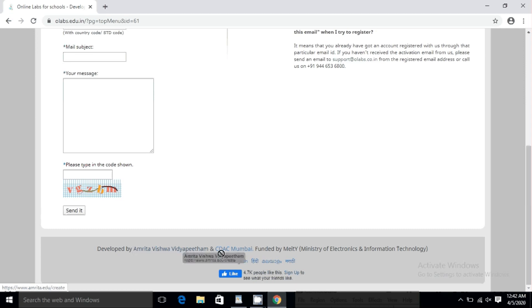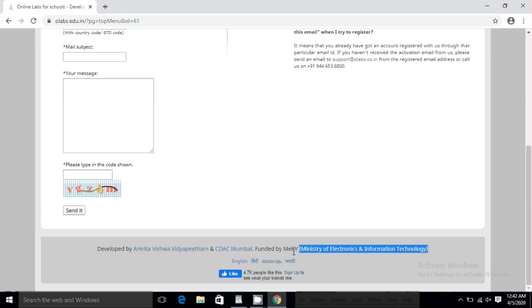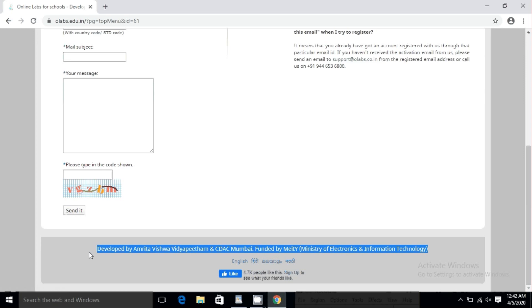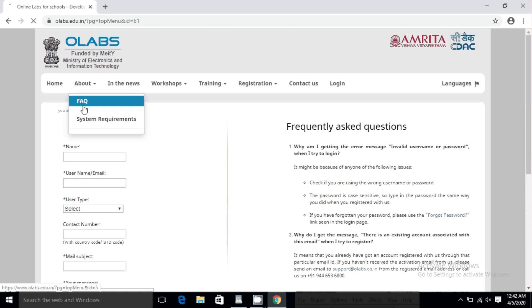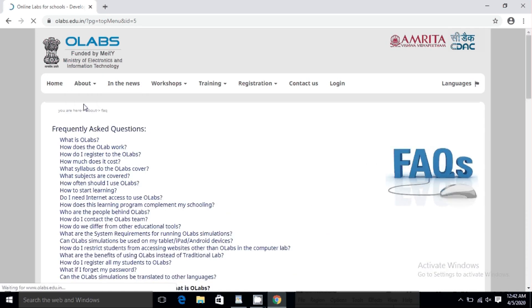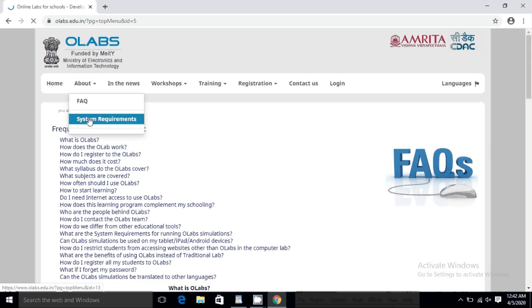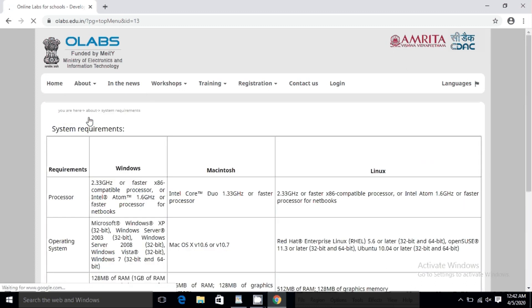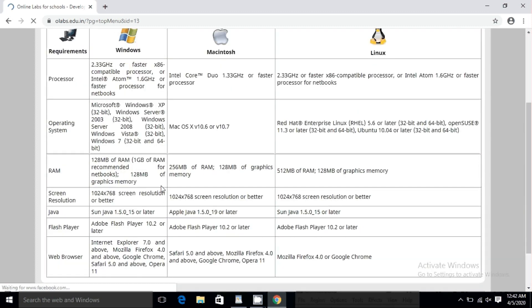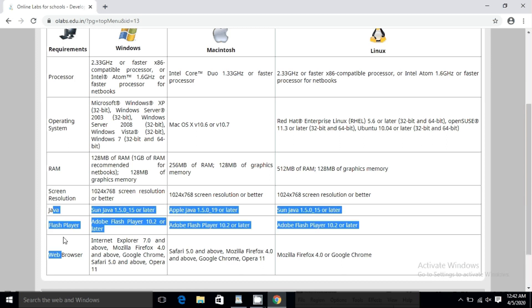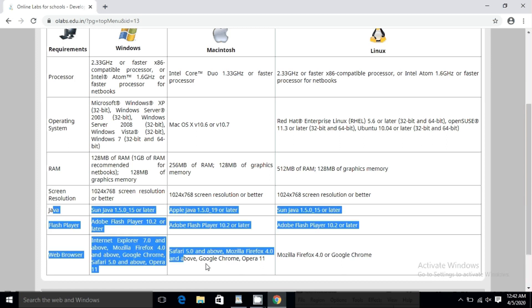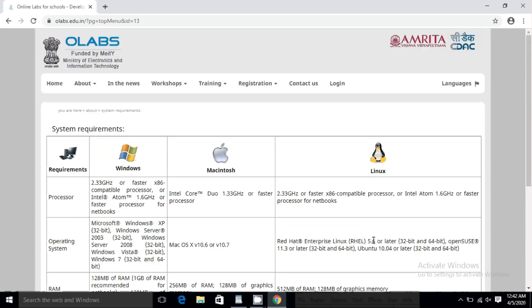It is also supported by CDAC Mumbai — the Center for Development of Advanced Computing — funded by the Ministry of Electronics, Government of India. This project is very important for school students under CBSE, any state boards, or NCERT. There are frequently asked questions you can explore, and some system requirements to check, as you may face technical issues due to different browser configurations. Make sure your browser — Chrome, Internet Explorer, or Firefox — is up to date.